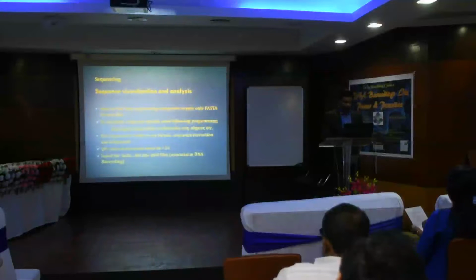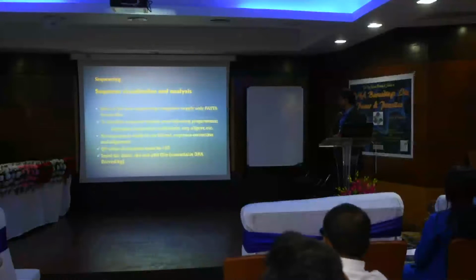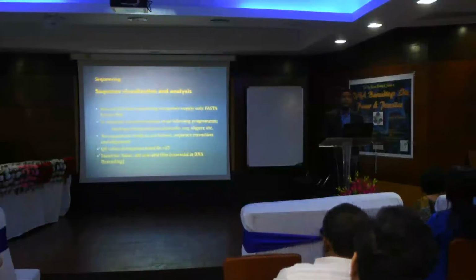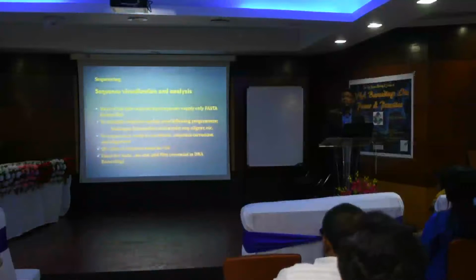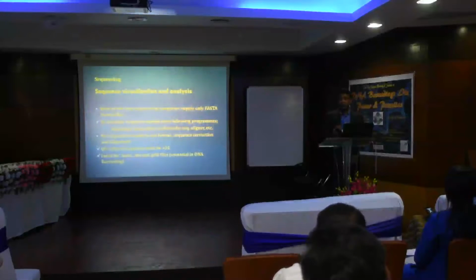So I will switch on to sequence visualization and analysis. You will have rigorous training on this today. Most of the time sequencing companies supply only FASTA file formats. There are a lot of companies you will see in Delhi, Bangalore, even Ahmedabad, Mumbai, some in Pune, and I don't know about Kolkata. Even in Korea people are sending samples, but they are least bothered about what you want to do.